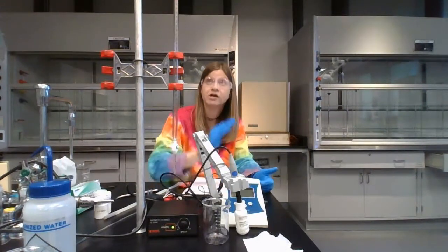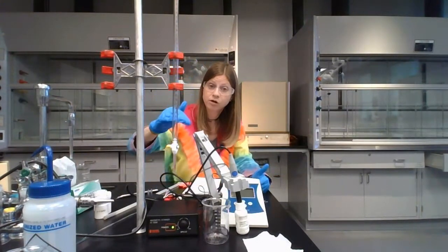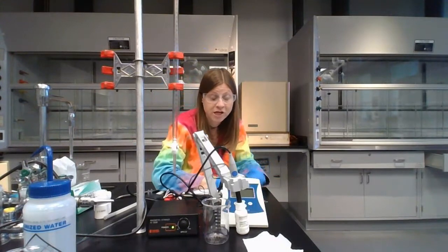That would be worst case scenario if it took the entire burette full to get to where the pH value stopped changing. Knowing in real life, hopefully you're not using that much, but that way you've got enough to condition and you're prepared for it. Okay.